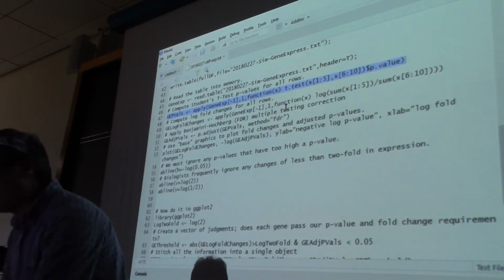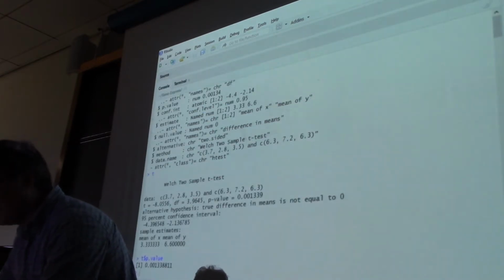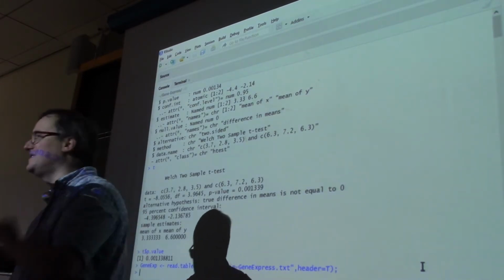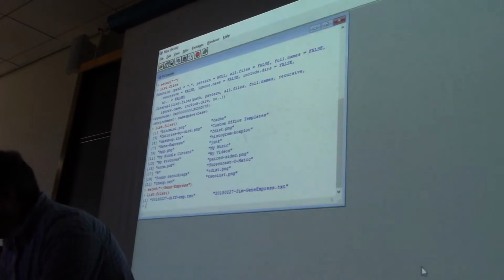Well, some of you have already run it, so that's not quite fair, but that's fine. I'm going to catch up to you now. I'm going to go ahead and run that command. And eye blink. Within less than a second, it has run 1,000 t-tests. So, oh, sorry, that was the read table.